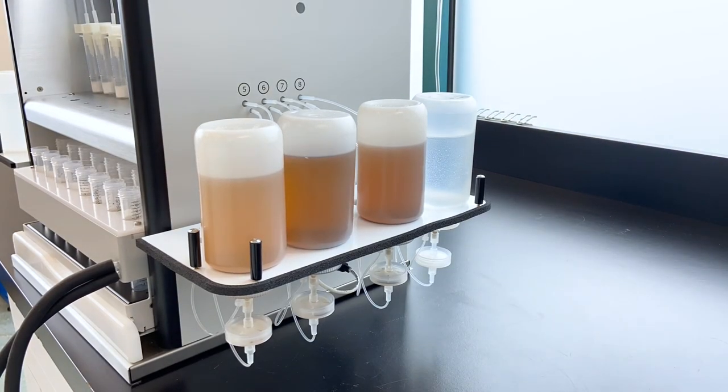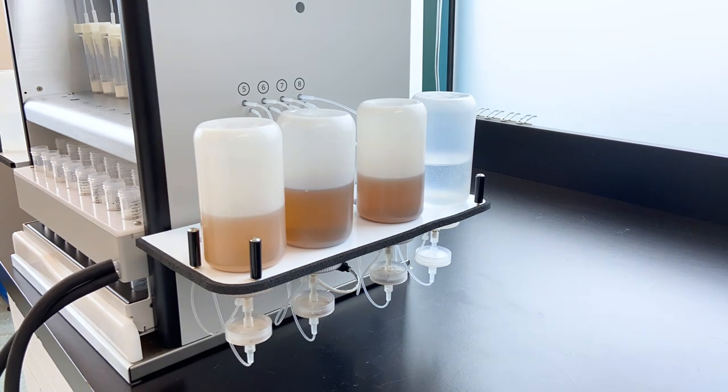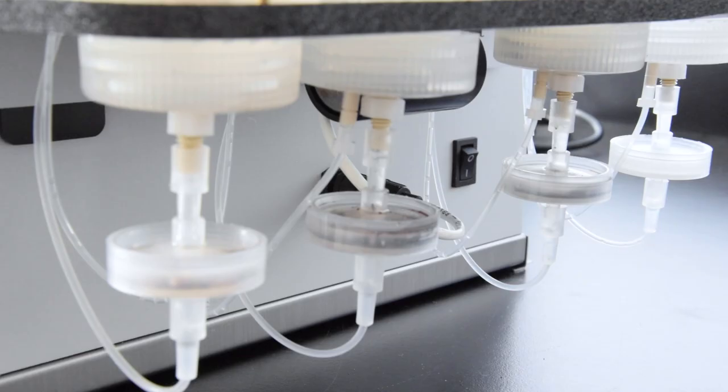That's a pretty useful feature that will save time from not having to filter some of these samples, although I know there's some debate on whether filtering the samples could lead to inaccurate measurements. You raise a good point, and in this case, we are not actually pre-filtering the samples. With the inline filters, the whole sample passes through as it is extracted. During the bottle rinsing steps, the solvent used to rinse the bottles can then be drawn through the inline filters to recover any trapped analytes.